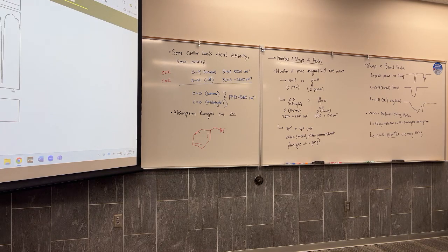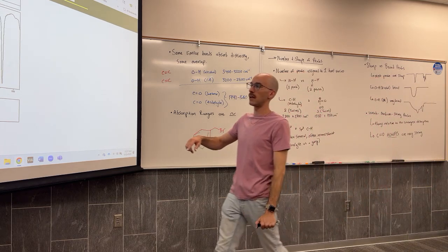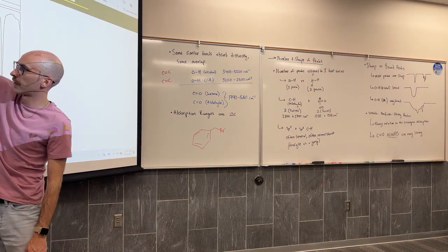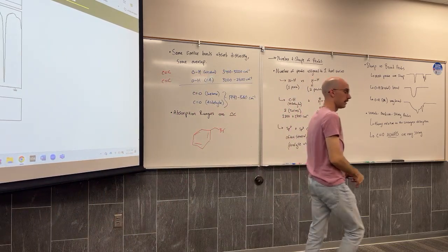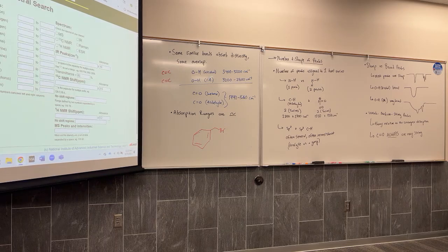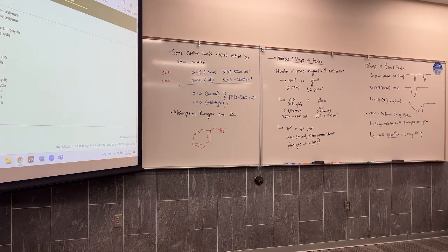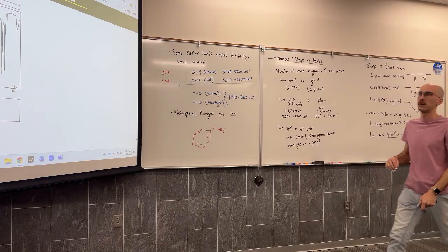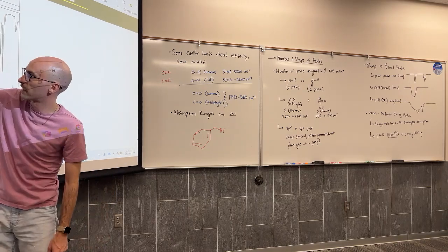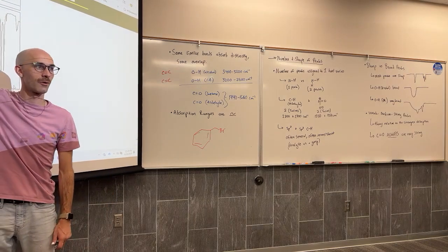So let's do a comparison. Let's say here the sp2 CH of the aromatic ring looks like it's coming almost 75% of the way down the transmittance. Let's change this and look at benzaldehyde. Benzaldehyde has the same ring, but also a CO double bond. The CO double bond is a strong absorber, and relative to that, the sp2 CH looks weak.